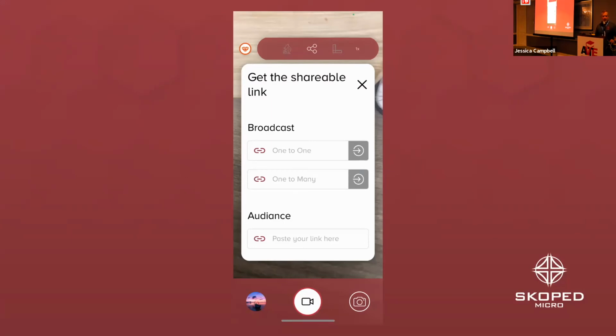I don't want to run out of time, but in this case, there are some people that are not able to show their screen, but they are able to see through the microscope. I did this slide like 6 days ago, so I'm pretty impressed we're still able to see the demodectic mites.